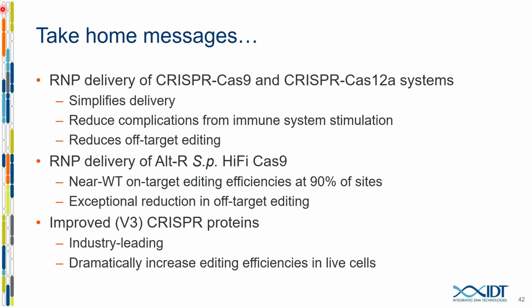For Cas9, we're saying it's not a requirement, but we still recommend using it. On the outside chance that you've picked a guide that is going to give poor editing efficiencies, regardless of what protein you're using, it's still not a bad idea to use the enhancer. It's not super expensive, and I don't think it's going to hurt at all. So the answer is yes, we're still recommending using them. And all of the other Alt-R products will work seamlessly with the V3 proteins.